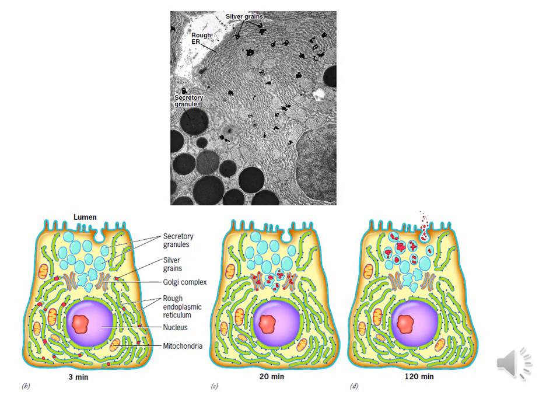We can see this in the slide. Figure A represents the autoradiograph, and in figure B we can see that at 3 minutes the protein has just been synthesized in the rough endoplasmic reticulum, at 20 minutes it is transferred to the Golgi complex, and at about 120 minutes it is secreted out. So we can find out the mechanism of membrane transport by autoradiography.